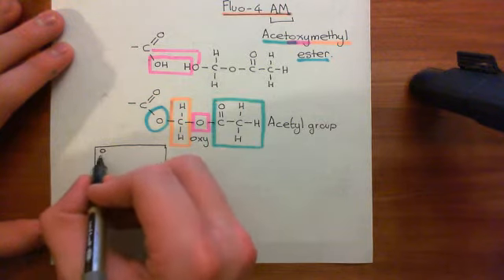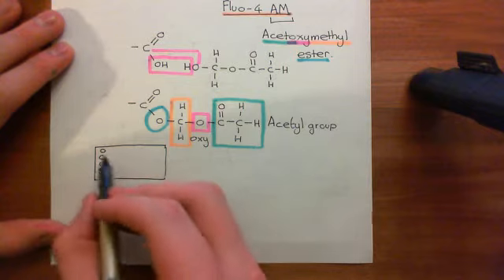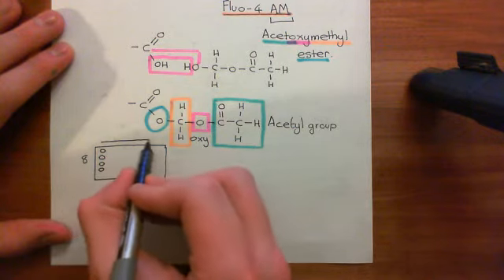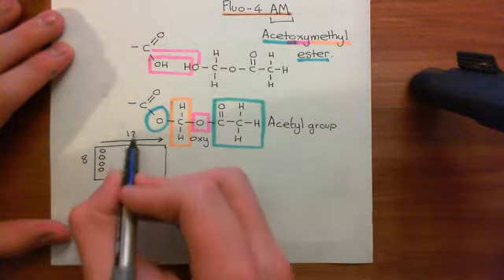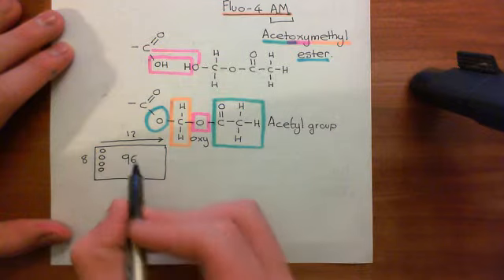So you'll have a plate where it has 96 wells, and I'm not going to manage to draw 96 of them, but you'd have 8 wells along this axis here, and then 12 wells along this axis here, to overall give 8 times 12, that's 96 wells on the entire plate.